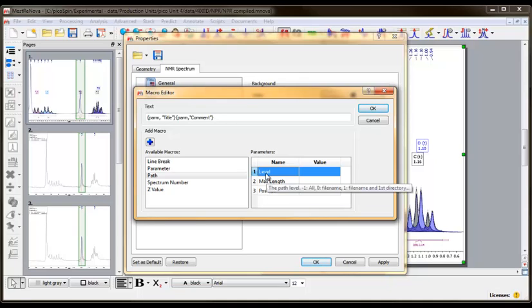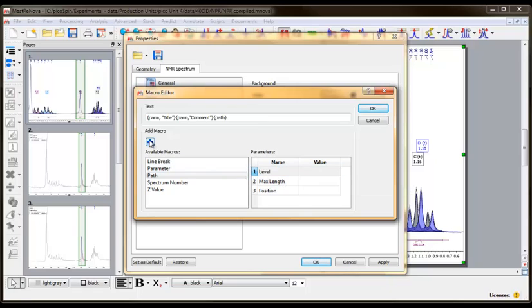Setting it to 2 will display the parent directory, and increasing values will work further up the directory tree. I'm going to leave these parameters blank, thus setting them to their default values. Click the blue plus button to add the macro, and then click OK to accept the changes.